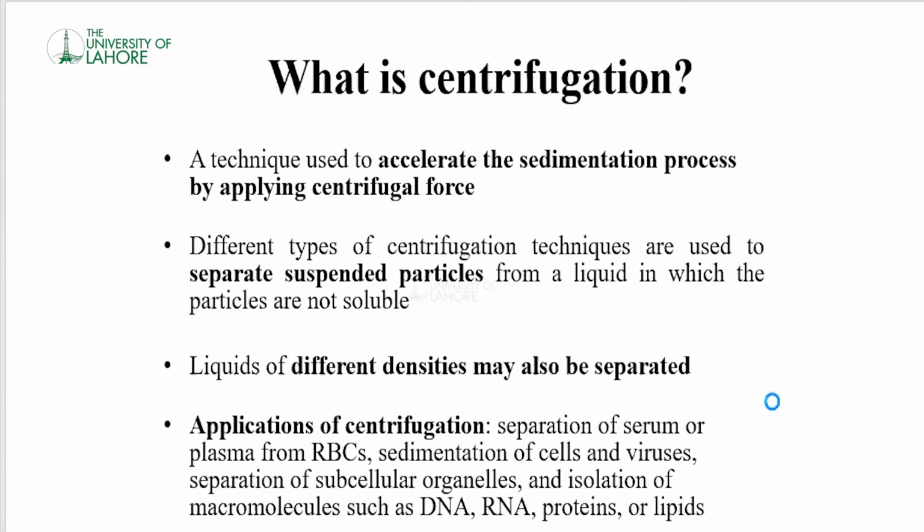What is centrifugation? A technique used to accelerate the sedimentation process by applying centrifugal force. Different types of centrifugation techniques are used to separate suspended particles from a liquid in which the particles are not soluble. Liquids of different density can also be separated out. Applications of centrifugation include separation of serum, plasma, RBCs, sedimentation of cells, viruses, separation of subcellular organelles, and isolation of macromolecules like lipids, proteins, RNA, and DNA.